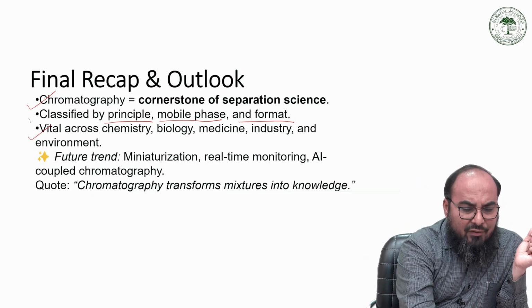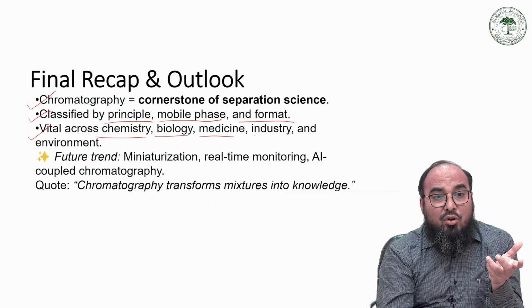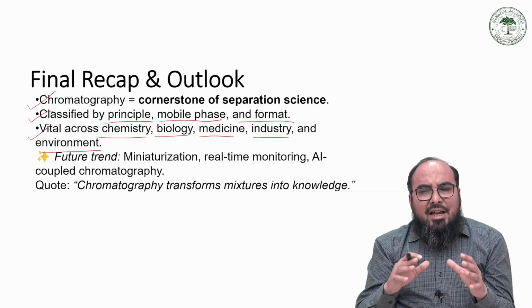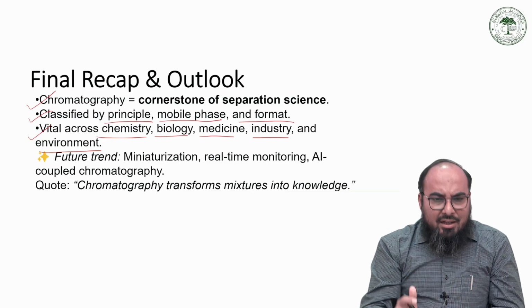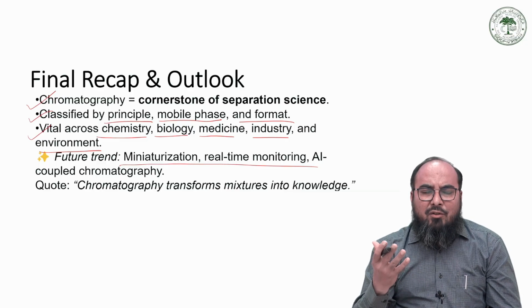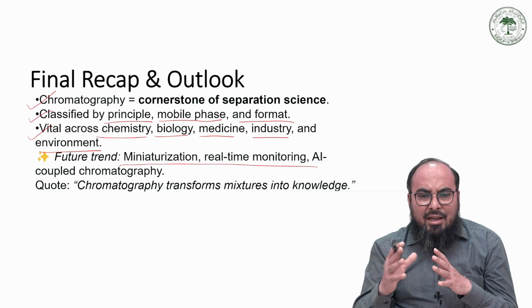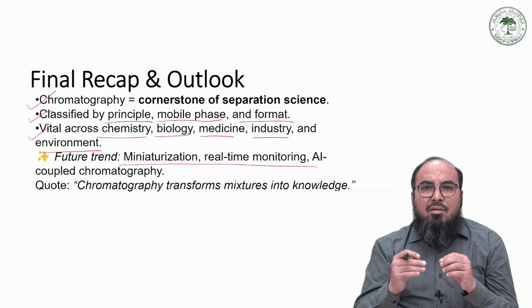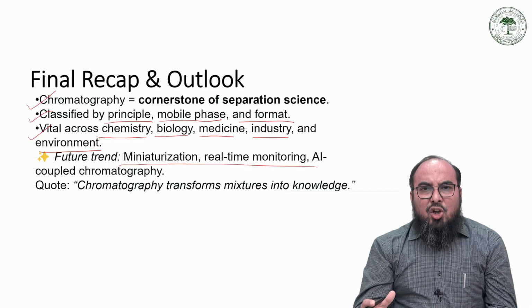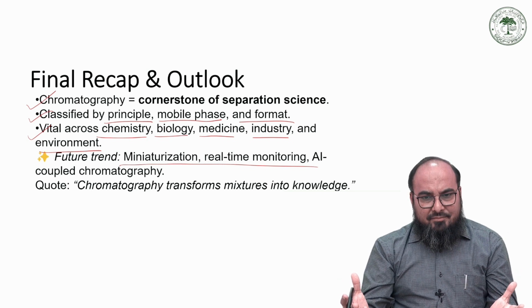This chromatography is vital not only for chemistry but for biology, medicine, and of course industry and environment. Nowadays, the technique is so advanced that miniaturization has occurred, and now we also have AI to help us. By combining these versatile techniques with AI, we can have very real time analysis of different constituents of a given mixture. So chromatography is transforming the whole landscape of separation science.